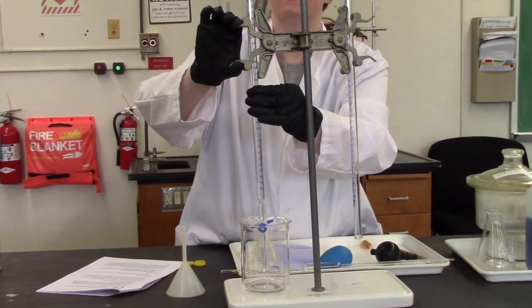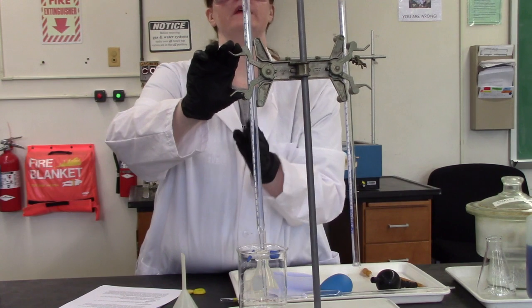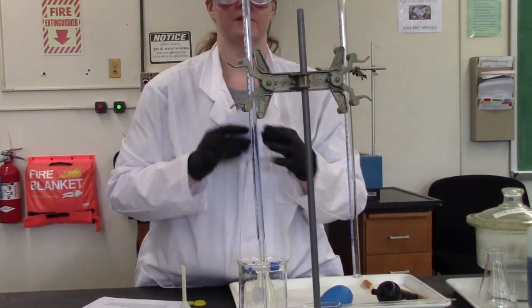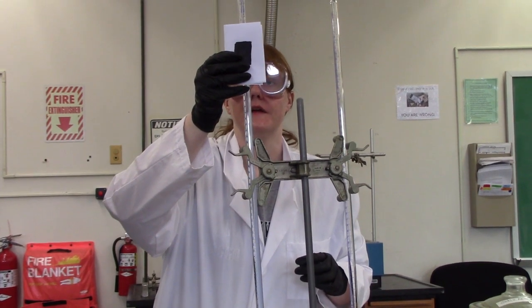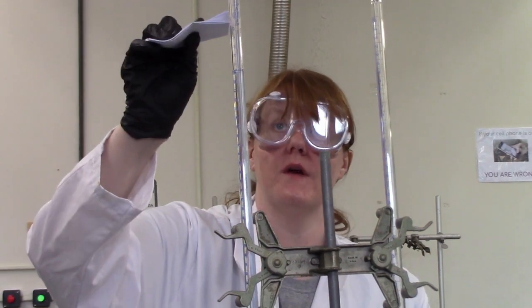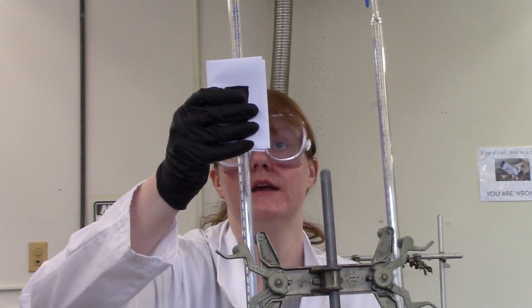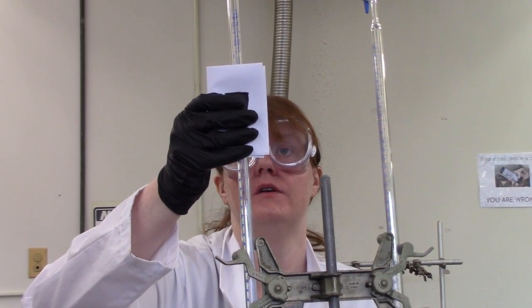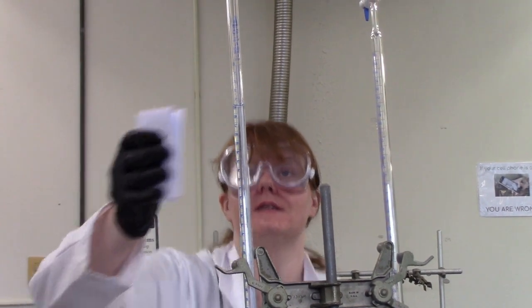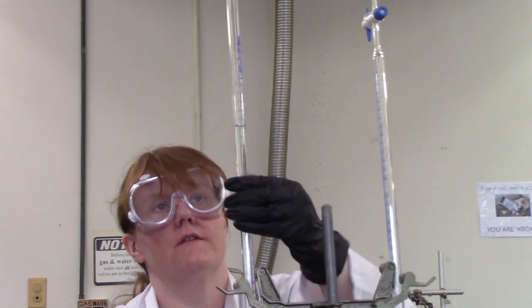So I'm going to read this, and then what I want you to do is see if you get the same measurement. I like to use my little paper so that it's easier to see. And I have to remember that this records to two decimal places. It's also kind of backwards. So zero is up here, and as we go down, we're measuring how much liquid has been added. So here, my initial reading is going to end up being about 4.6, no, call it 4.78. Okay, so I'm going to turn it around, get a good shot of it for you, and see if you agree. Remember, of course, that the zero is up there.